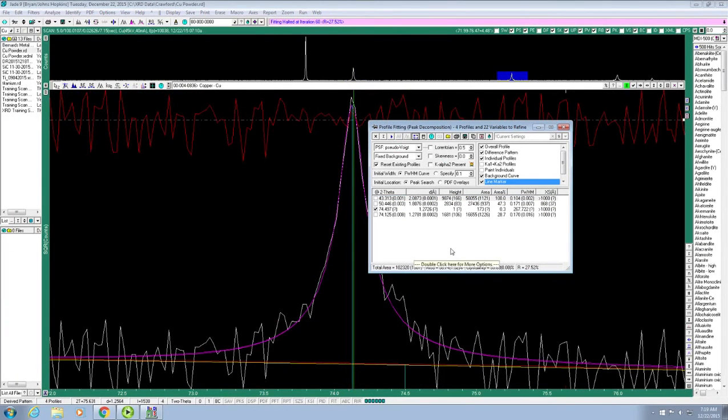Notice that one, that's a good example. It gave me two peaks here. It gave me one at 74.49. If I mouse down here, notice the red slide bar that exists right down here as I mouse around. And also down in this region, we see the 2 theta value. So I'll go on top of where I think the peak actually is, and it shows it at 74.13. If I go to 74.497, so 74.497 up here, that would be about this location.